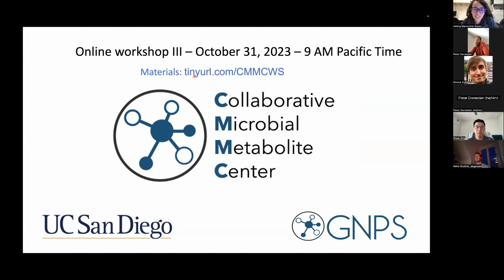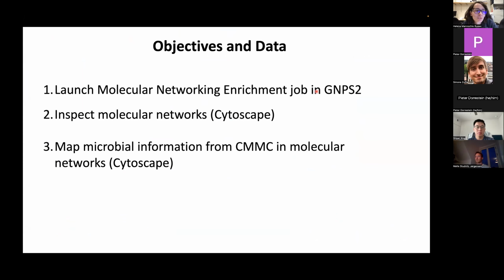Okay, so good morning or hello, everyone. I'm going to be carrying you through the hands-on part of this workshop. Our main goals now will be to launch a molecular networking enrichment job in GNPS2, to inspect these molecular networks in Cytoscape, and map microbial information from CMMC in the molecular networks in Cytoscape.